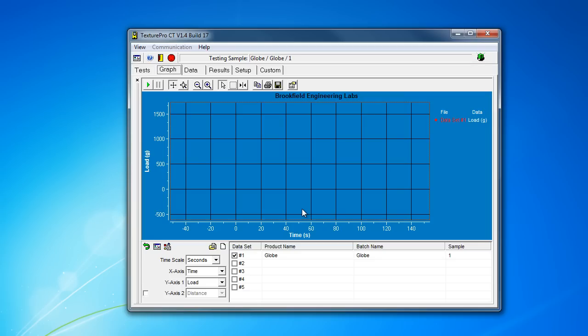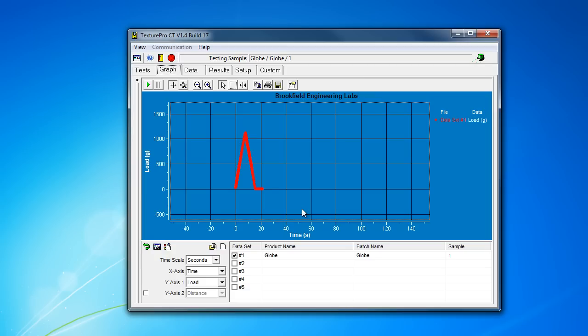To speed it up a little, you can move the platform up. But there's really no guarantee that your operators will be able to set the platform to the same location every test or every repetition between days. It's not always the most reliable. You can also swap on a longer probe, but in our experience, it tends to make working with containers and odd objects really more difficult than it needs to be.